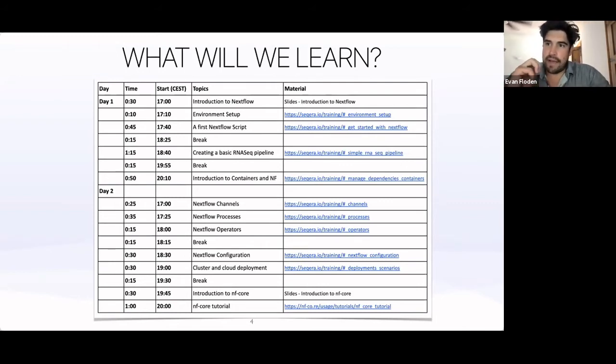For the final section today, we will be doing an exercise where we will build the container that we used to run that RNA-Seq pipeline. This is general purpose in the sense that it's not specific to Nextflow, but it gives you a concept of how these containers work. If you're already a container guru, maybe you want to skip that section, but I would recommend it if you're new to containers or even moderately interested, because we'll dive in deep to what we're going to go through there.